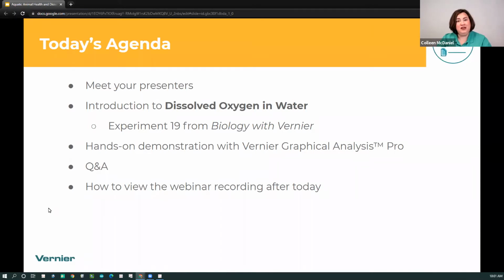We're also going to cover a hands-on demonstration of using the Pro version of Graphical Analysis, and one of the great features of being able to data share. Then we will have a little question and answer session, and make sure you understand how to get your webinar recording after today.